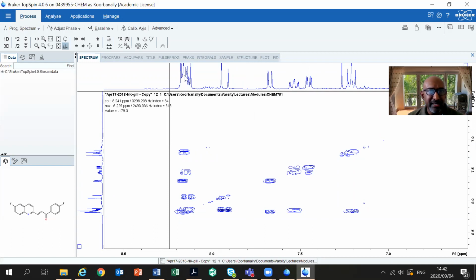I also know that in this mess here, I have the equivalent two protons. So I've got 2 protons in there, and I've got a third proton in here, right? And remember yesterday we said there were 5 protons in here. So we identified 3 of the 5 protons in this mess. Let's see if we can find out what the other 2 are, and let's see if we can find out what these 2 are. All right, so we've got these 2 left here. So I'm going to take this smaller coupling constant first.